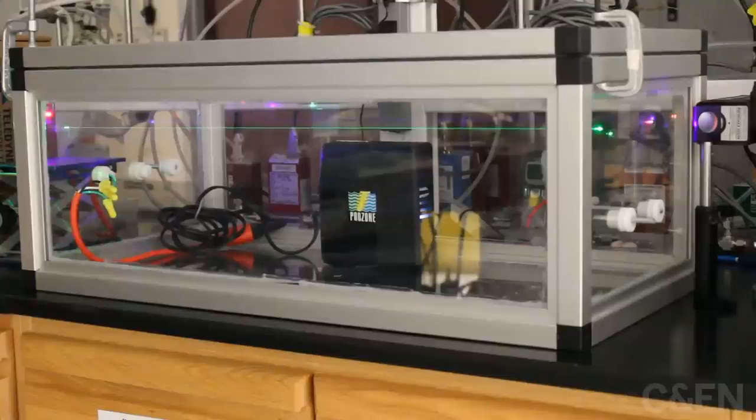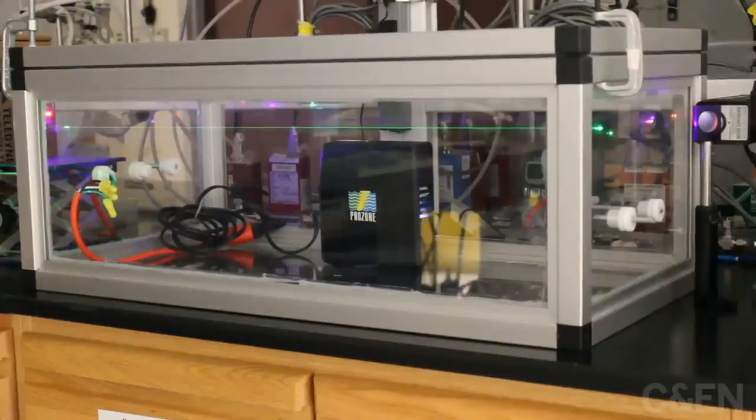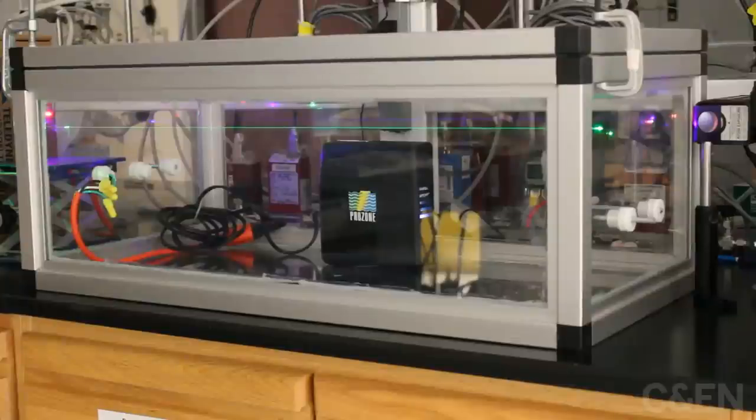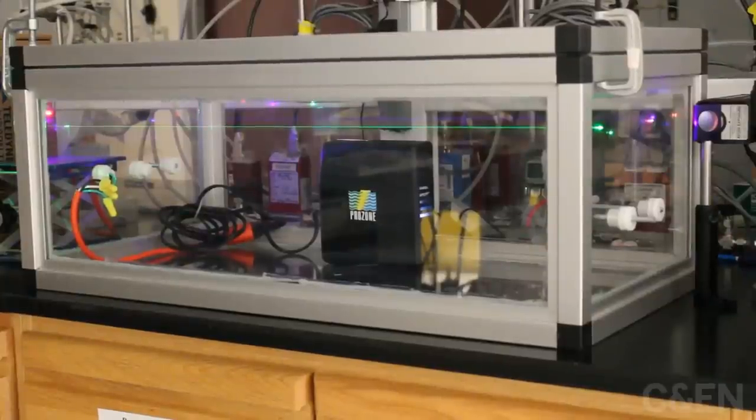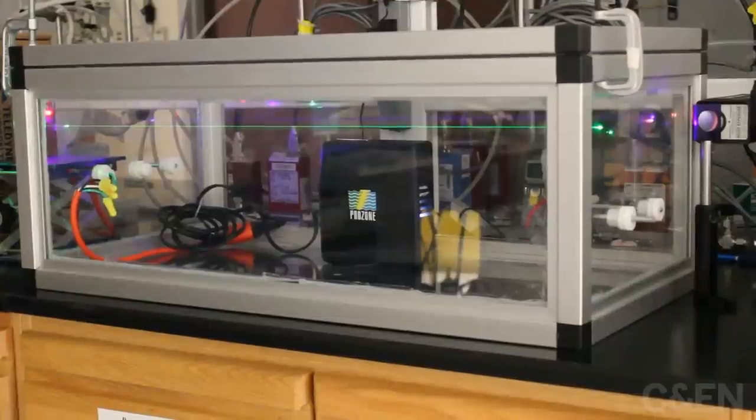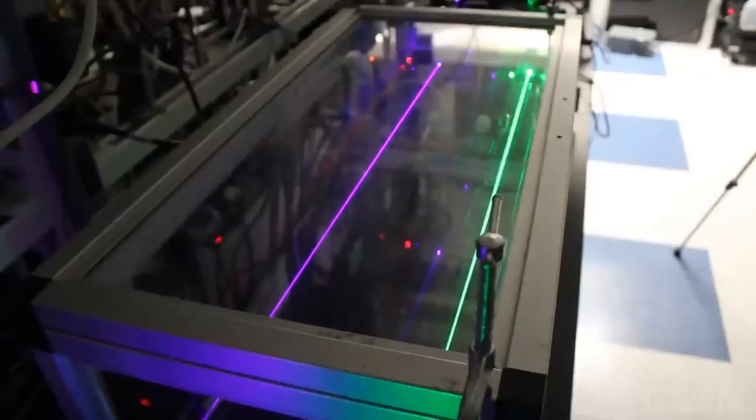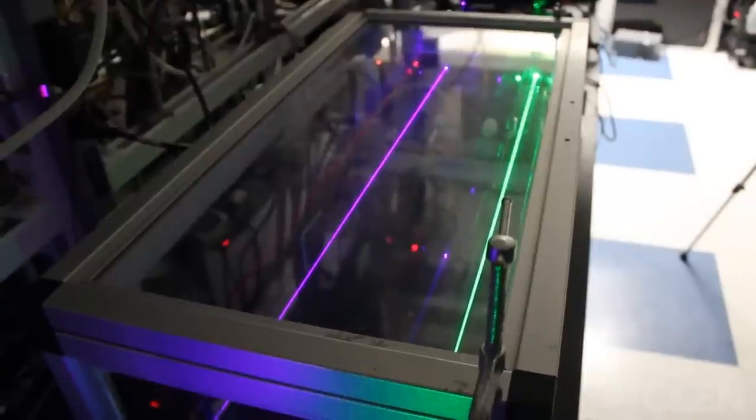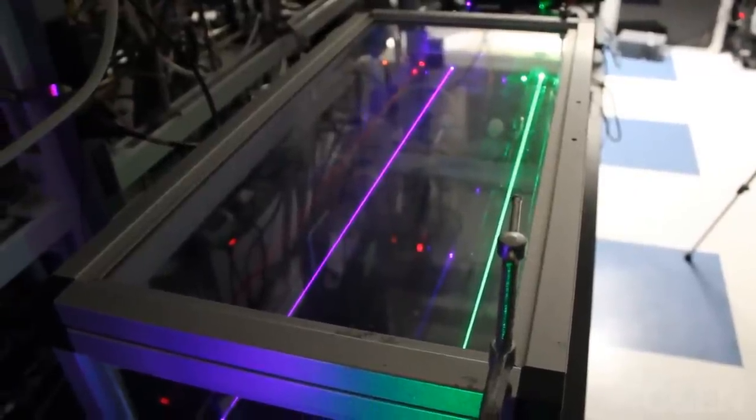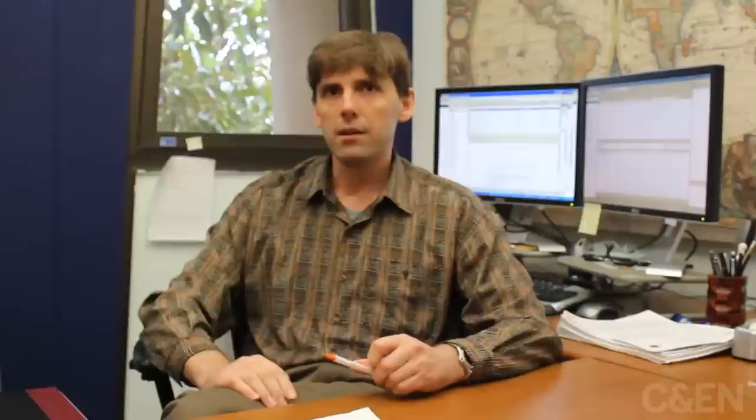The reaction products were condensing into aerosols. And you could see these aerosols through scattering of light. So we sent a few laser beams through the box. And there were very bright traces of these laser beams because there were particles that were scattering the light in every direction. So it's a very handy way of knowing that you have a ton of them in the chamber.